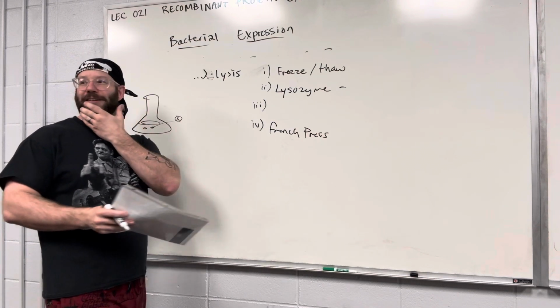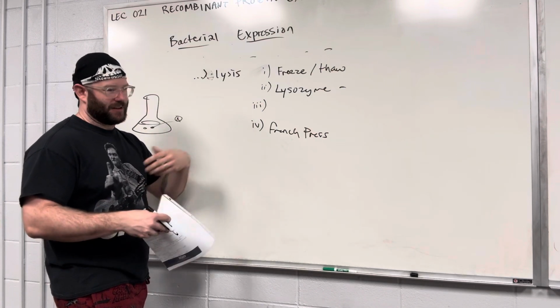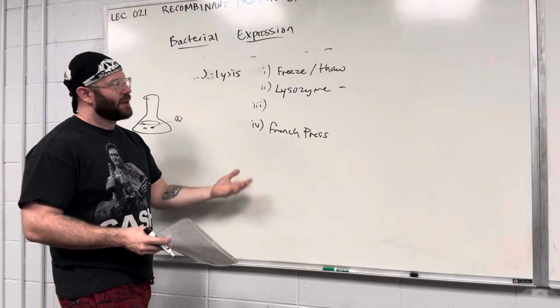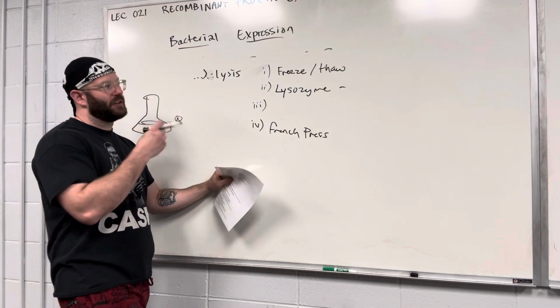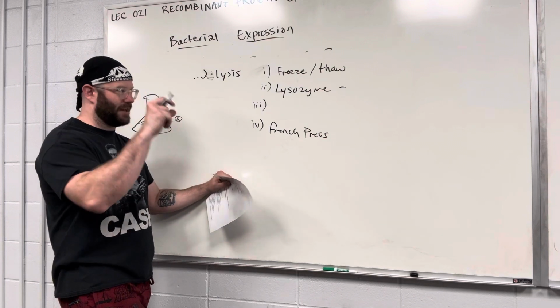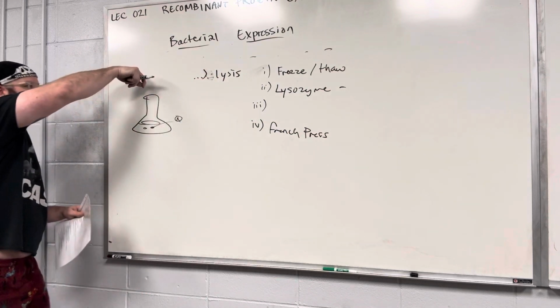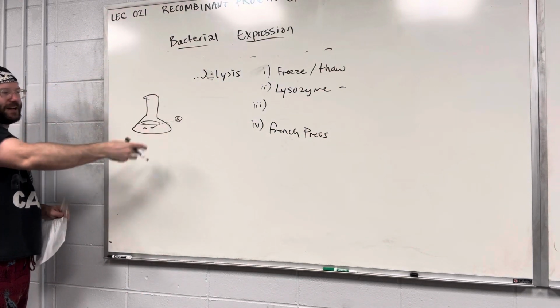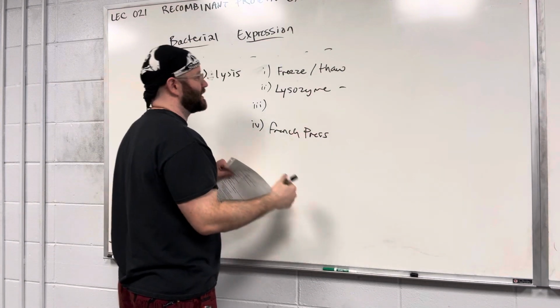Because they need to hatch from the egg. Yes, they need to protect themselves. So it's essentially like an immunity protein that's expressed highly abundantly in eggs. So you can purify that from eggs, and it's a common molecular biology reagent. Usually every biochemistry lab has lysozyme in the freezer. So you'll just take what's called a pinch of lysozyme, you'll open up the container, you'll grab a pinch, and you'll just kind of drop it in your Erlenmeyer flask, you'll shake it around, and that just enzymatically will dissolve the cell wall.